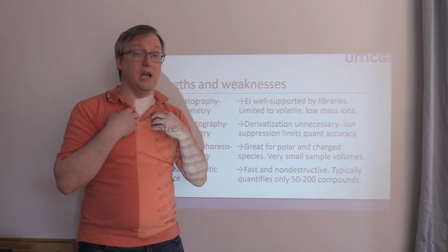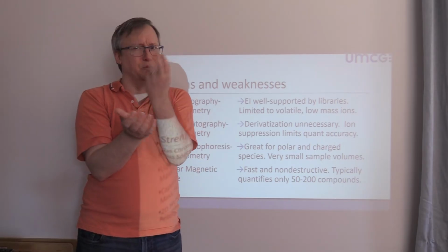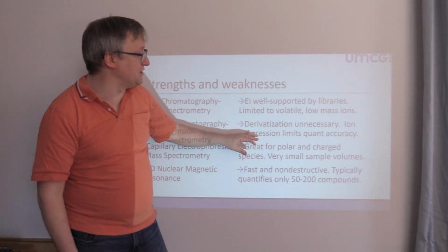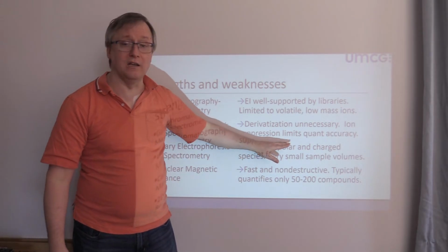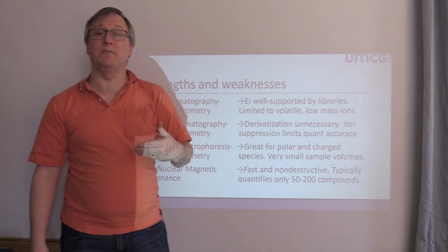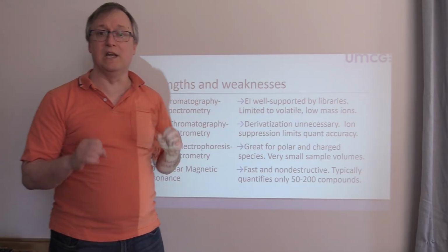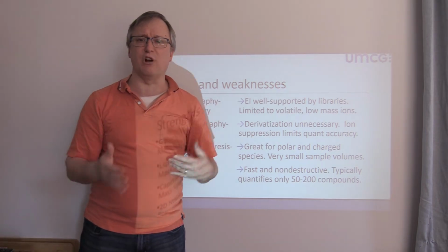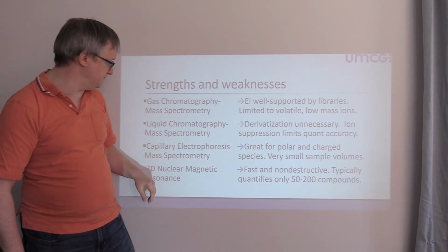And you might be co-eluting with another metabolite that's really good at grabbing protons or very good at giving up charge. So in that case, our quantitative accuracy can be compromised in LC-MS if a whole lot of ions are coming off the column at the same time. They tend to crosstalk a little bit in that respect.